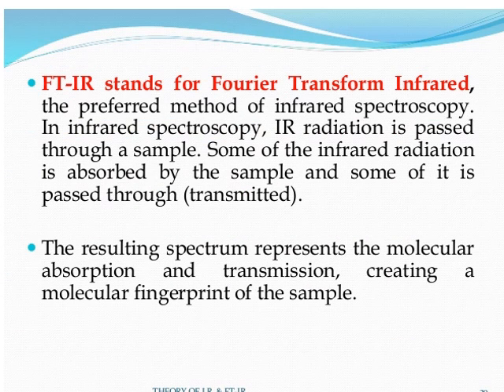Study about FTIR spectroscopy, which stands for Fourier transform infrared spectroscopy. It is a preferred method of infrared spectroscopy. In infrared spectroscopy, IR radiation is passed to a sample. Some of the infrared radiation is absorbed by the sample and some of it passes through, or is transmitted.